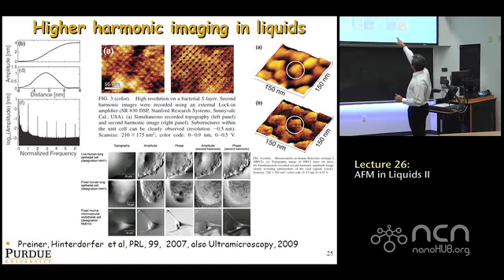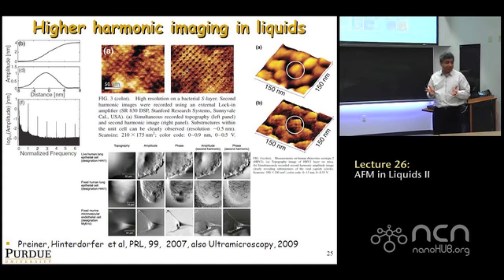Whenever you plot an amplitude error, I encourage you to actually plot the range. Say that, over the sample, my amplitude error is just 1 nanometer. That's good practice. But I have known papers where people just publish the error map as the image because it looks good. And there are problems. What is the amplitude supposed to be over a sample? Constant. It's tapping mode, right? The fact it's not constant means your controller is not doing the job it's supposed to do. Of course, the scale is not available here. I'm sure this group is so good at these things, and if you look at the scaling, even though you see the contrast in amplitude, there is very little variation. I'm sure the controllers are all set properly, but it's just an observation that when you do your work, you should be careful about it.